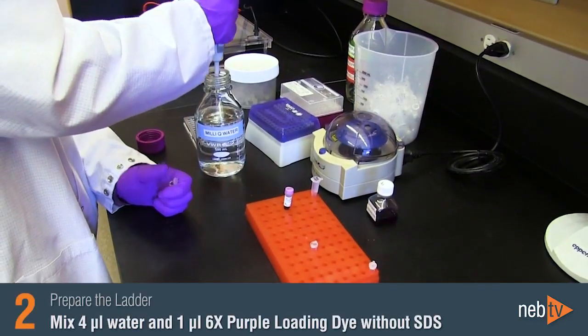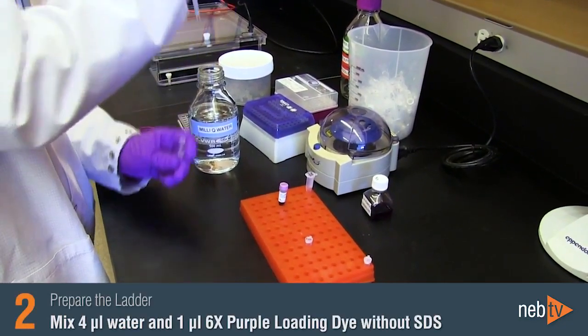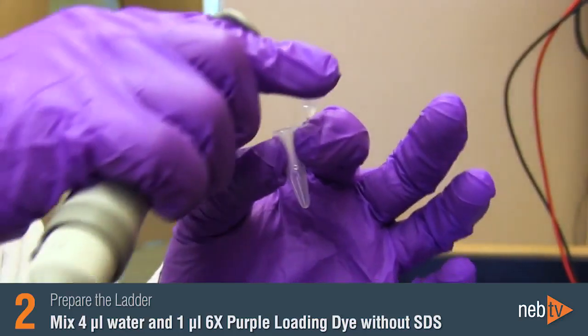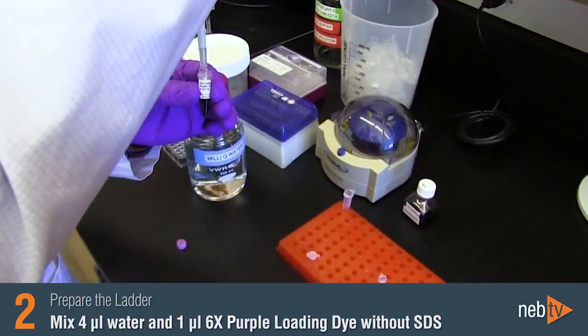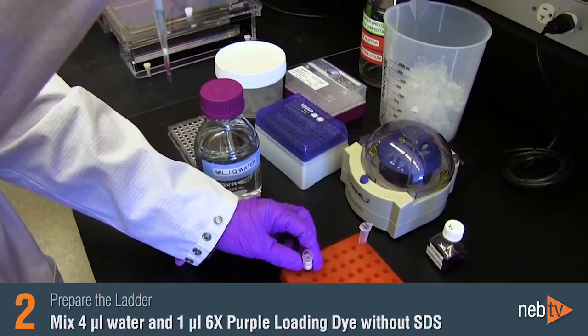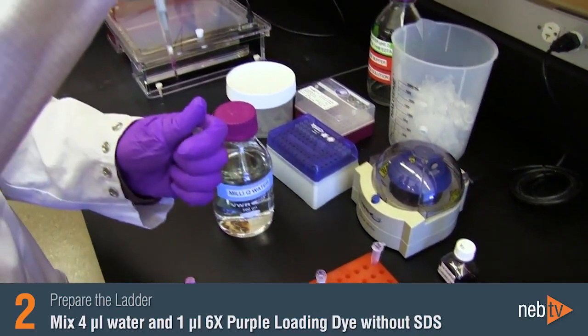Now we can prepare our ladder. Add 4 microliters of water to your tube or well. Then add 1 microliter of the 6X purple loading dye without SDS, which is supplied with most of our DNA ladders.